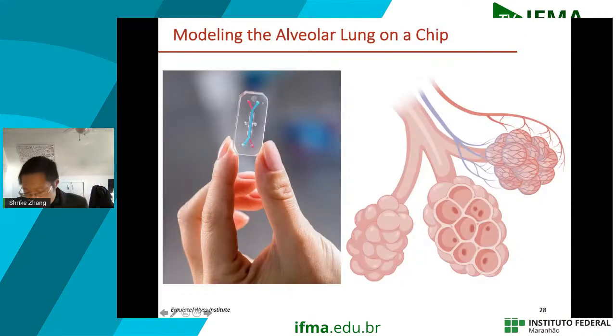All right, so for the last maybe 5 minutes, I'm going to talk about another sort of combination. So not really bioprinting here, but more conventional biofabrication to model a distal lung on a chip in vitro. So people are probably very familiar with these Emulate chip devices, right? So basically, they have a flat surface that's modeling a lot of tissues, including the lung. But the issue with that is sometimes when it's a lung model, or specifically an alveolar lung model, it's not really structurally accurate, right, because it's still a flat surface.